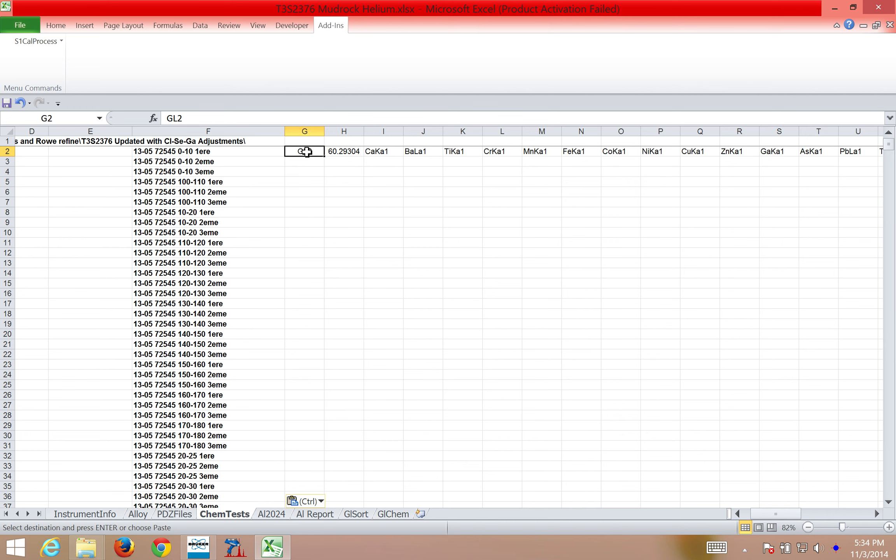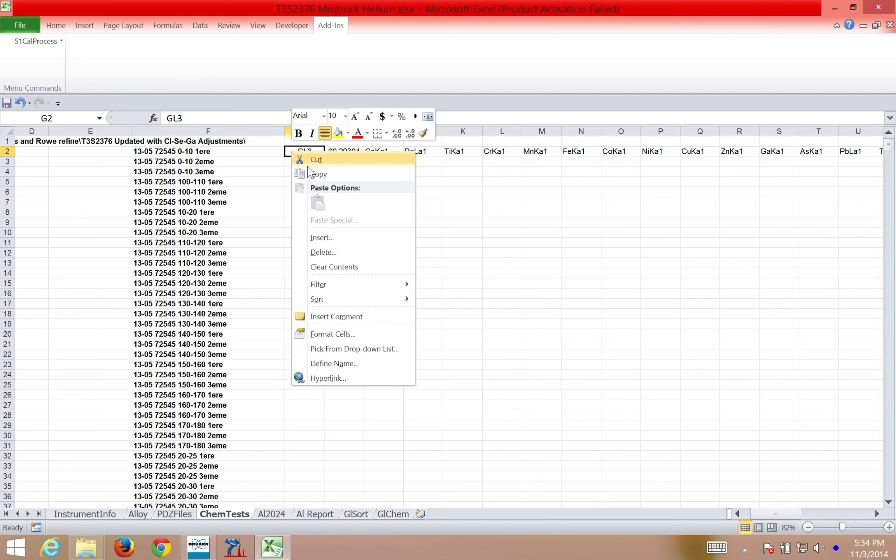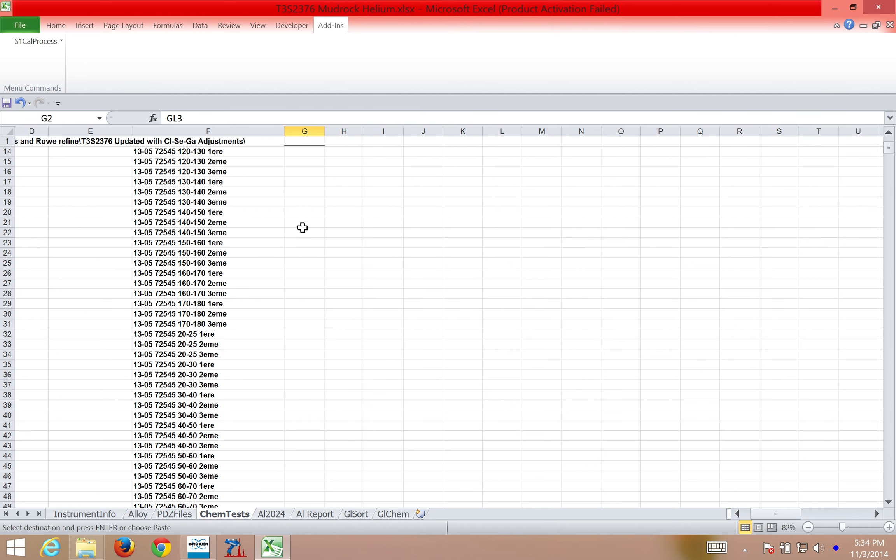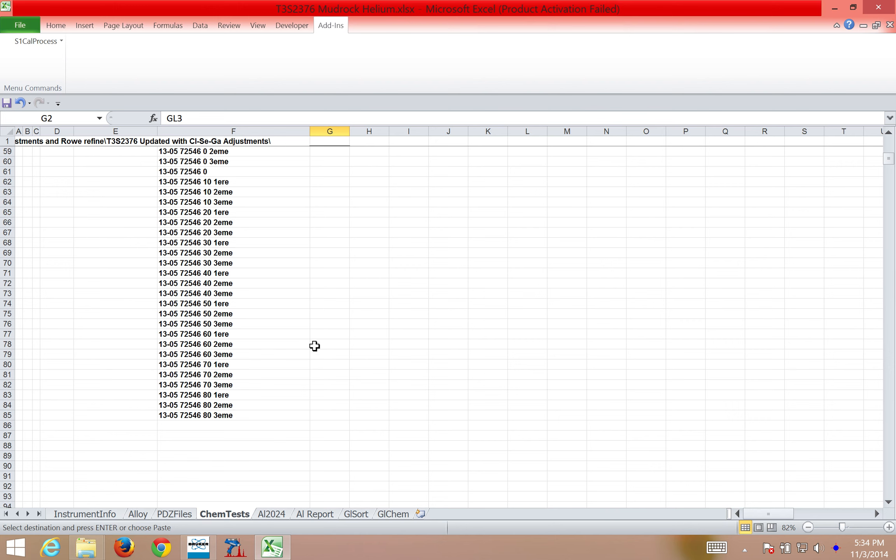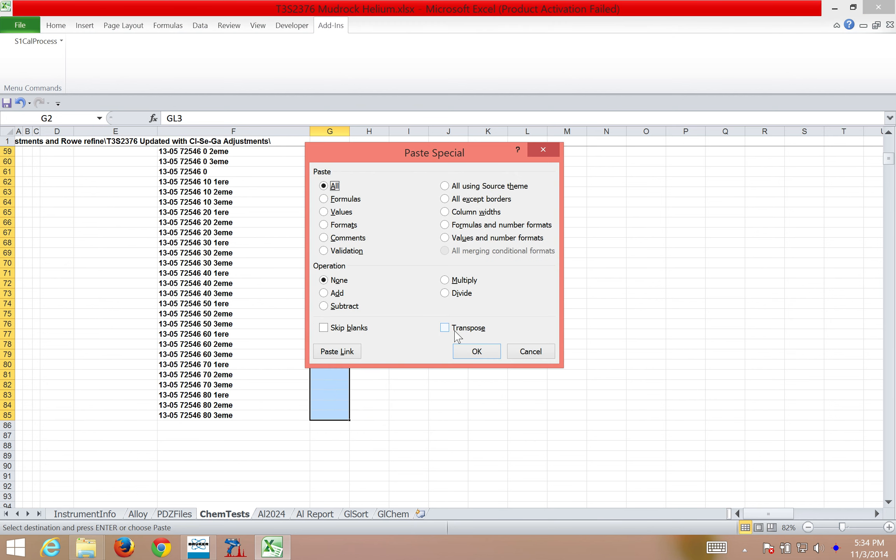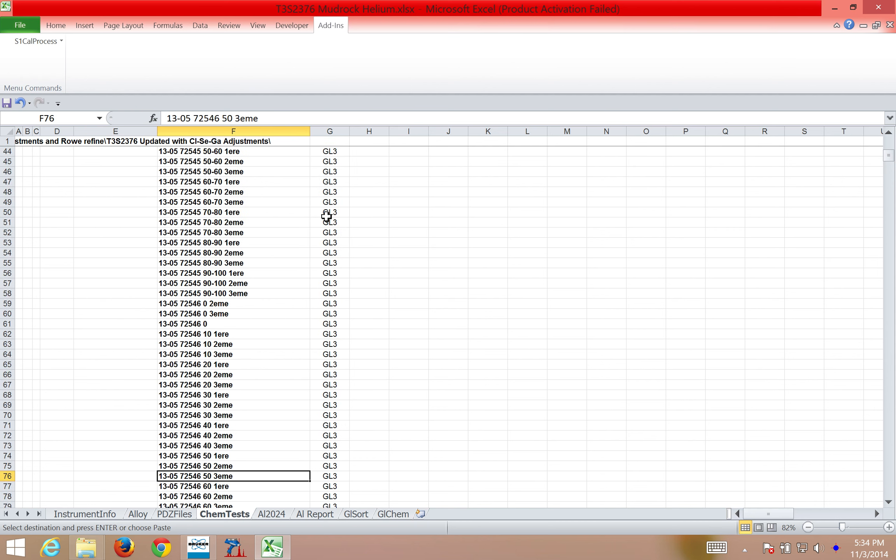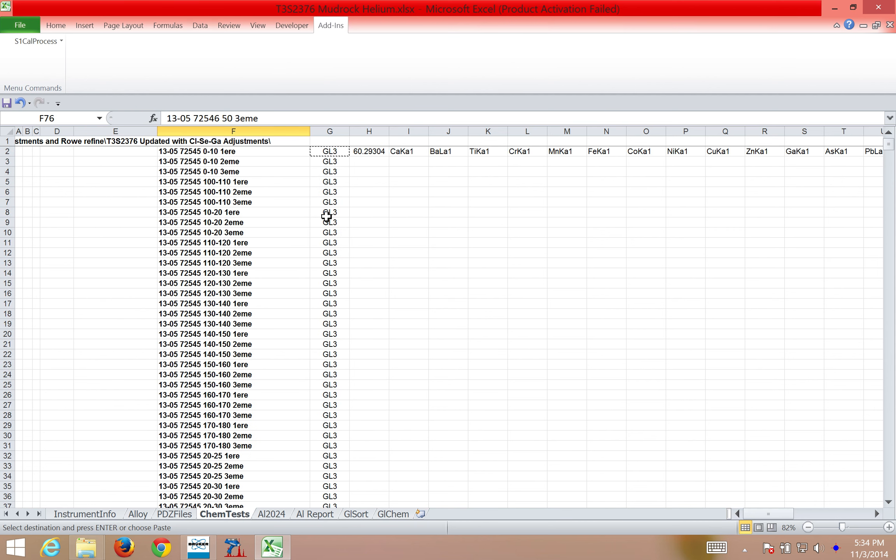Next, I'm going to select GL3, which is the calibration file. Your calibration file name refers to a specific set of accumulation conditions. In this case, GL3 stands for Genial Linear Chemistry 3, and this is the calibration file I created for helium data. I'm going to copy that, and I'm going to paste it here, so that way each spectra has a calibration file associated with it.